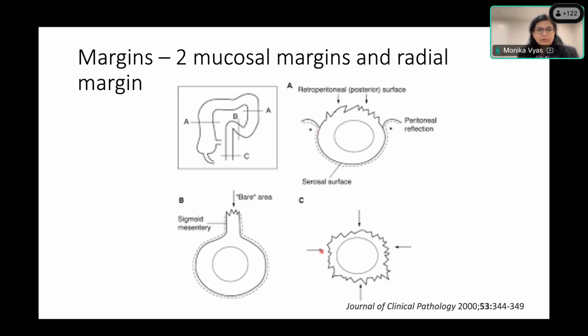Now, in the rectum, the lower rectum, as we discussed, is completely devoid of serosa. So what you will have is a circumferential resection margin or radial margin. And then some parts of the bowel have serosa encasing almost complete circumference of the bowel, with only an area where it reflects on the mesentery. So that would be your bare area or the mesenteric resection margin. So very important to know again what kind of surgery the surgeon has done in order to plan how you're going to evaluate and take your margin sections.